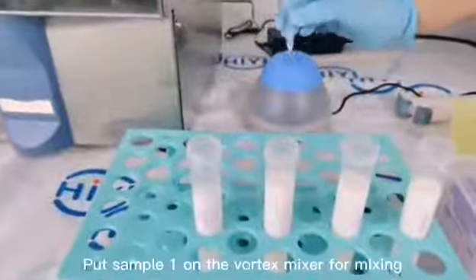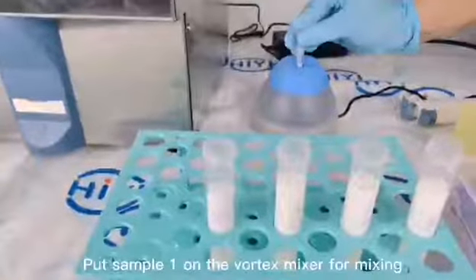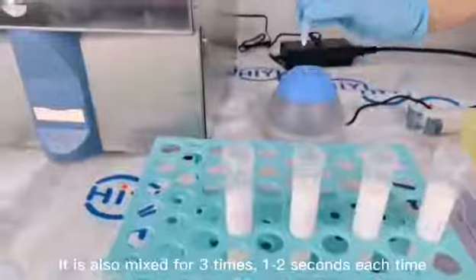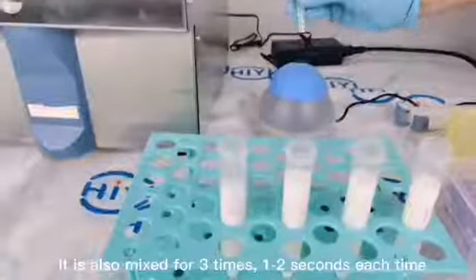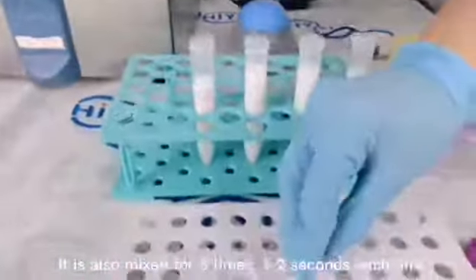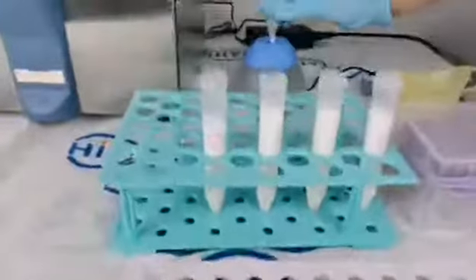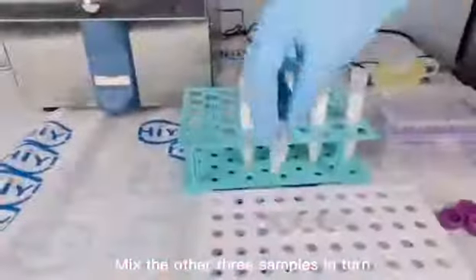Put sample one on the vortex mixer for mixing. It is also mixed for three times, one to two seconds each time. Mix the other three samples in turn.